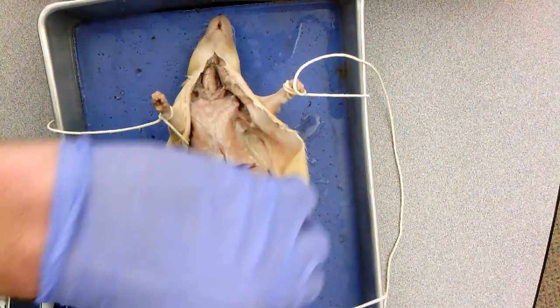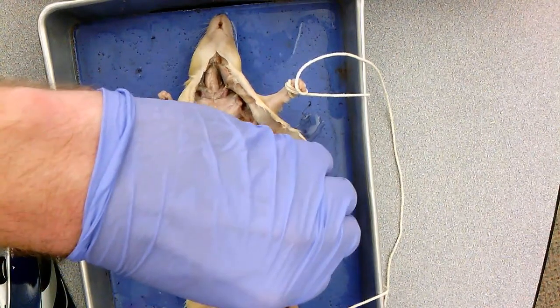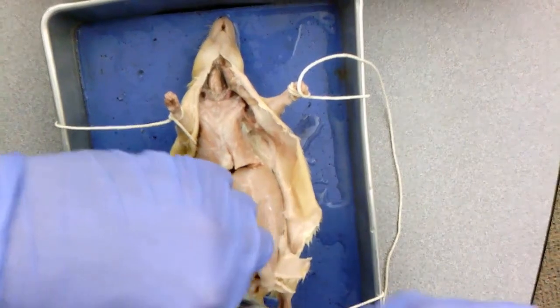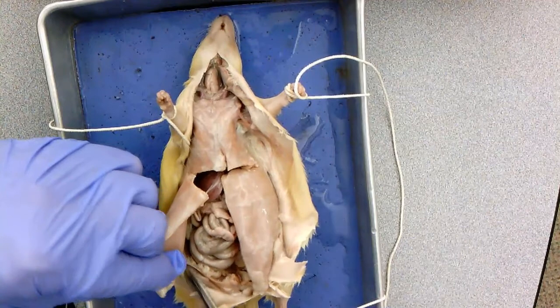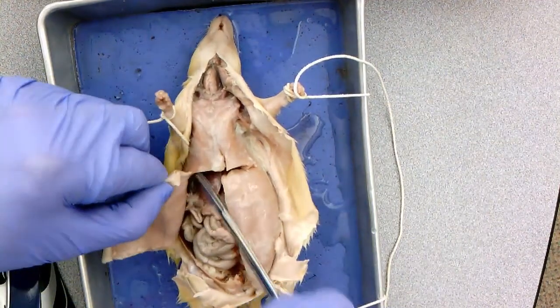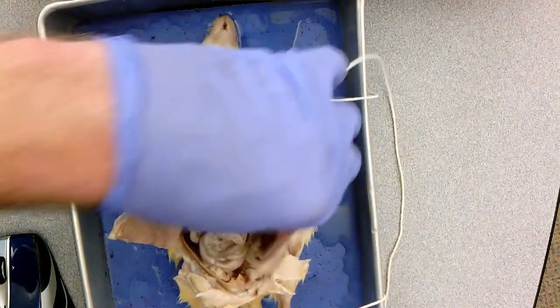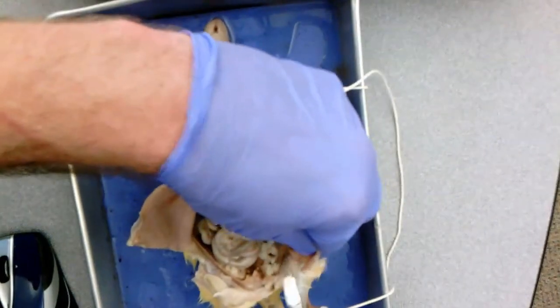Is what I'm going to do. And then even down here in this pubic region, I can make a little cut sideways as well to kind of open this region up. Notice I've not destroyed any of these internal organs in here whatsoever. It looks nice and clean. That's what I want it to look like. All right, there's going to be some fluid in there, and that's okay. You can drain that fluid if you feel like there's too much fluid.